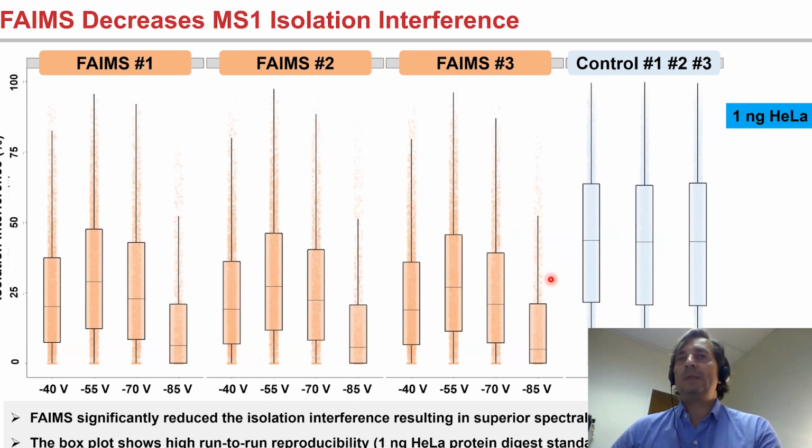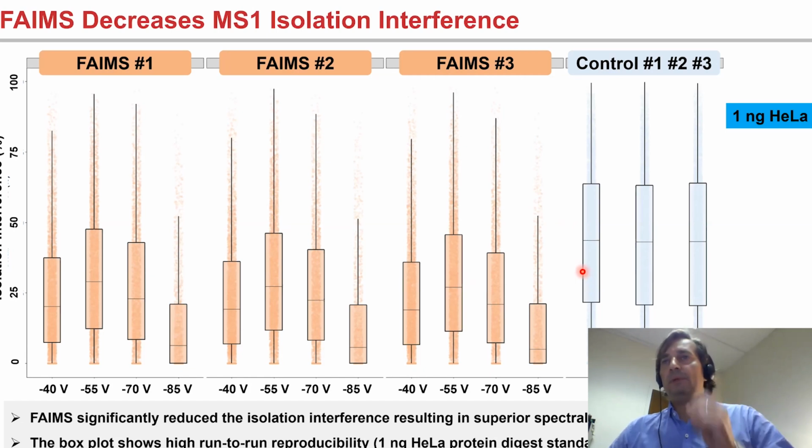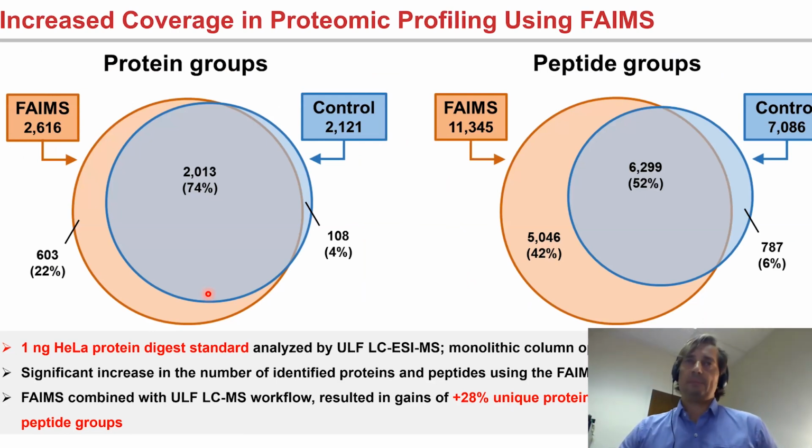So in comparison to control, on average we were getting significantly lower ion isolation interference, and that's when we were using ion trap data. We're selecting precursors of 1.6 m/z units. So for TMT, it should be significantly better when we use Orbitrap data. I don't have data here for TMT labeled limited samples, but we already ran some experiments for bulk samples, and we see clear benefits of the FAIMS.